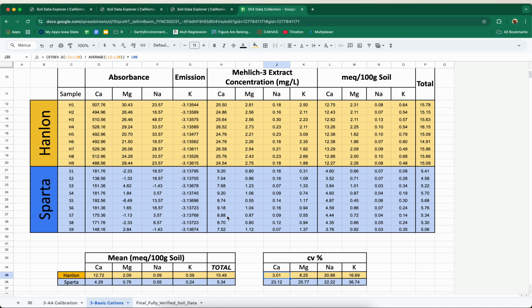But I will say I did notice a slight pattern in the titrations that potentially might have worked, those hyper diluted concentrations. I'm exaggerating a bit with the hyper, but they showed that the Sparta had a tiny bit higher on average. So pattern-wise, the Sparta required a little bit more of that dilute sodium hydroxide to titrate to the pink. But in reality, they were both almost less than 1/10 of 1%. So I racked my brain about that.